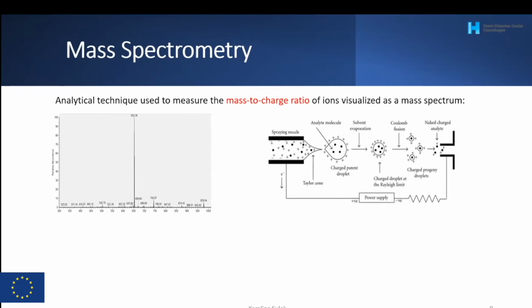So what is happening in the ionization part is that we are injecting the sample in liquid form, for LC, liquid chromatography. We are ejecting the sample and it is being ionized. Ionized means that a charge is attached to a specific molecule, and depending on the properties of this molecule, we get different states of charge.